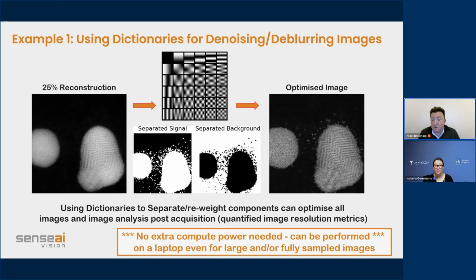It's a very straightforward installation. Once it's installed, it doesn't change everything else. You can turn it on or turn it off. Doesn't really matter. It's not a hardware change to the system that's causing all of the other methods to not work. It's not that when you install it, you have to use that. It's just a system, like if you turn on your EDS, you turn it on, you can use the sparse sampling and go through that process.